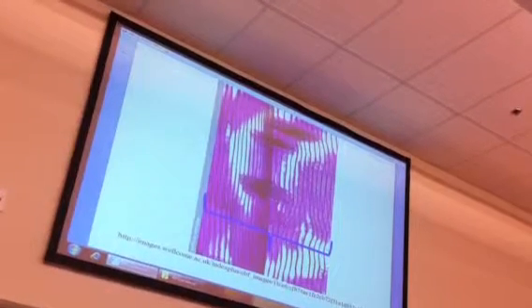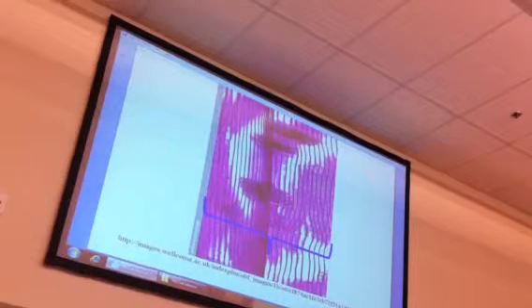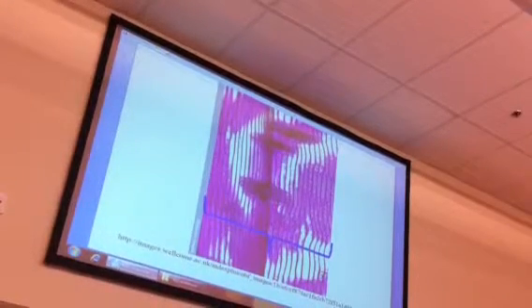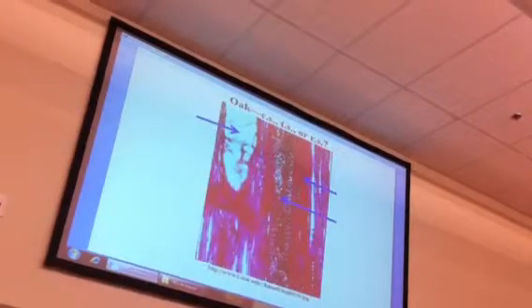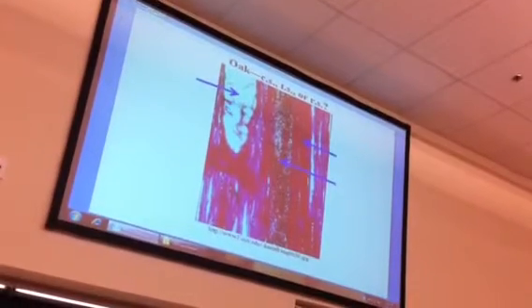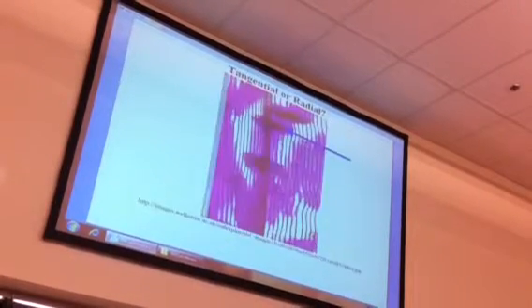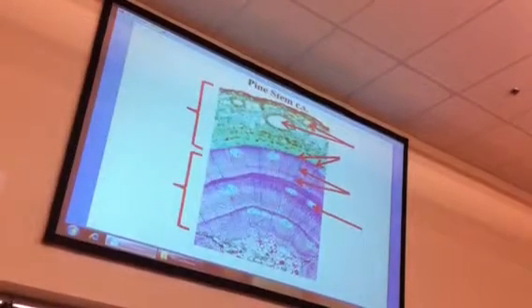You can clearly see what a tracheid is in a longitudinal view. If you have a longitudinal view of a vessel, all you see is a tube, like what you might see right here. This is vessels. This is a big tube. And this is a big portion of a big tube. Okay, that's tracheids.